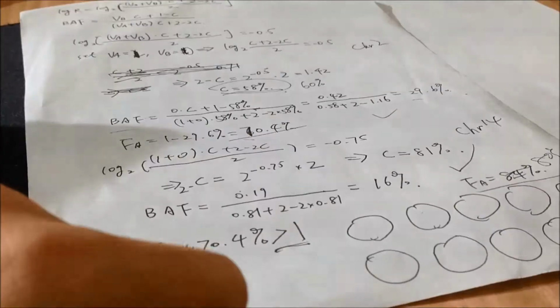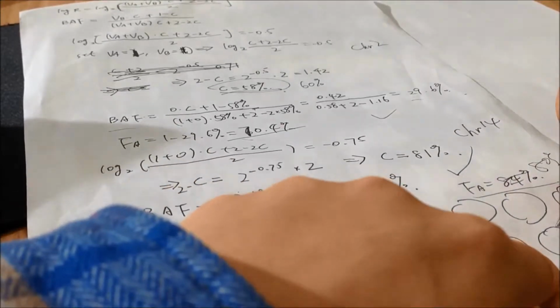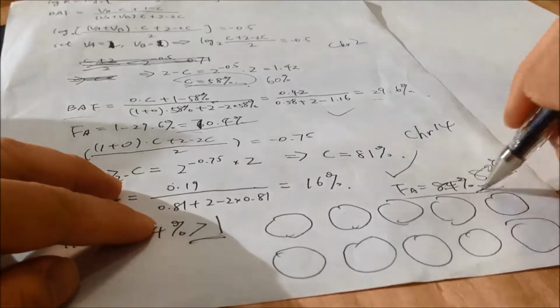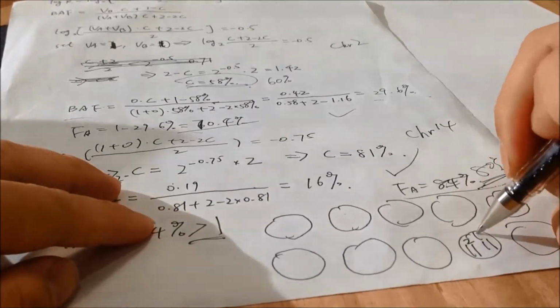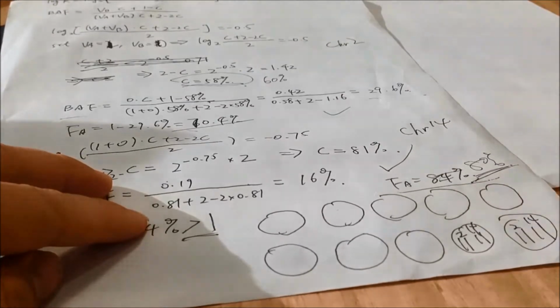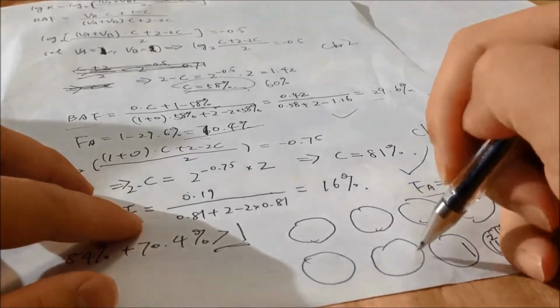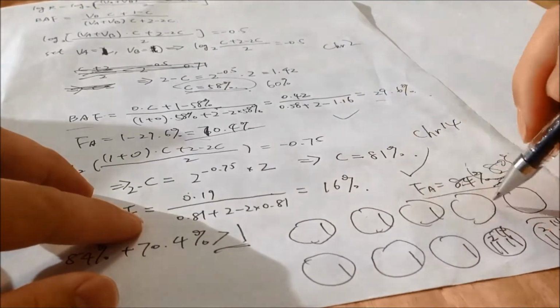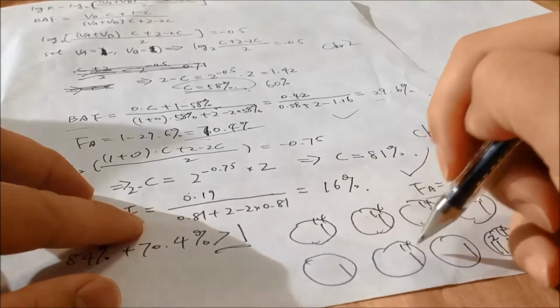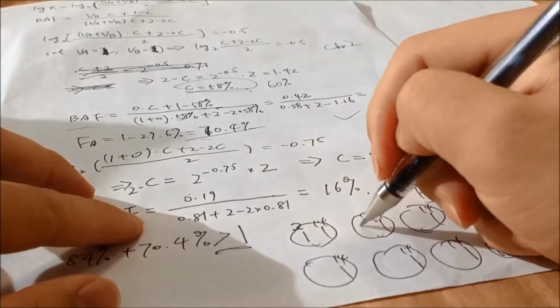We can get the figure that two cells are normal because the clonality is 80 for both copy number 2 in chromosome 2 and 14. And 80% of chromosome 14 lost one copy, together with 60% lost one copy.